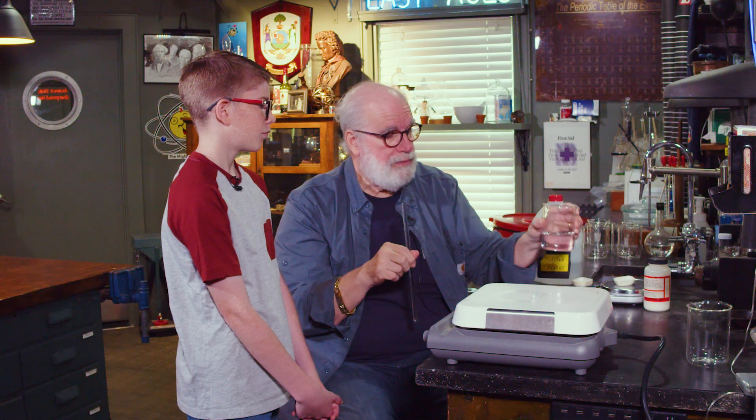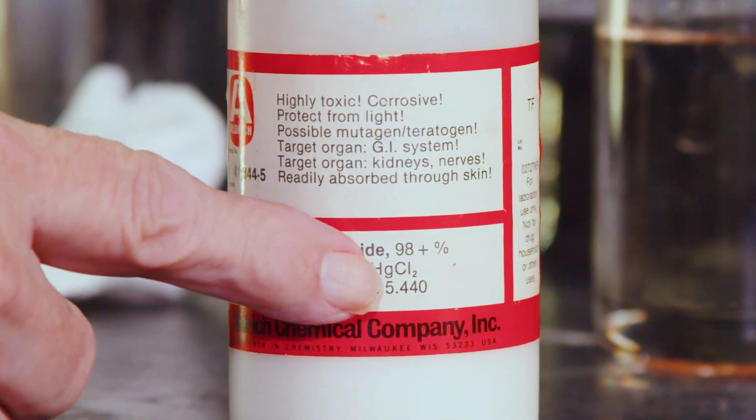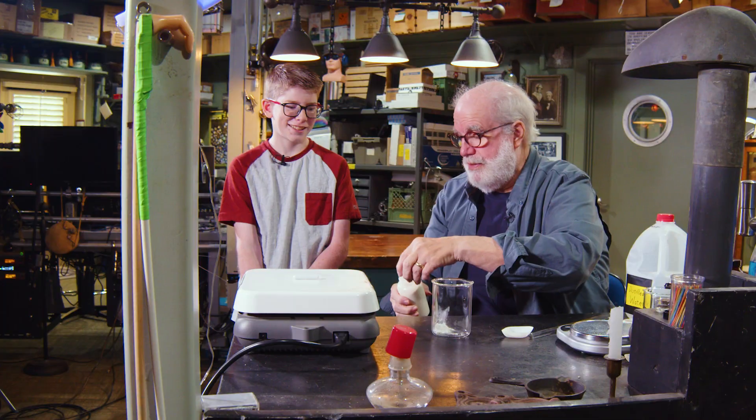So we just dissolved some potassium iodide in this beaker. I've got another chemical — mercury chloride. That means there's one mercury atom and two chlorine atoms put together in a molecule. I'd have you do it, but your mom's sitting over there — she's got a brick in her hand.